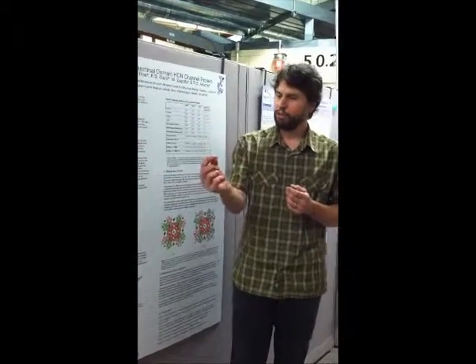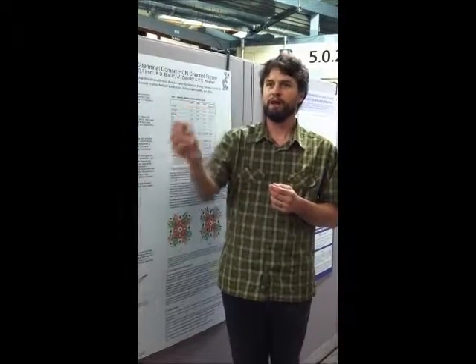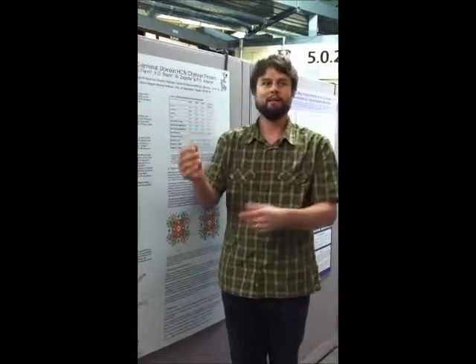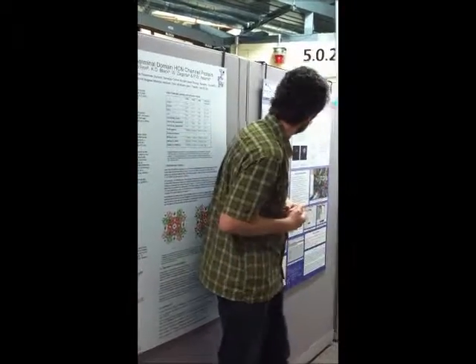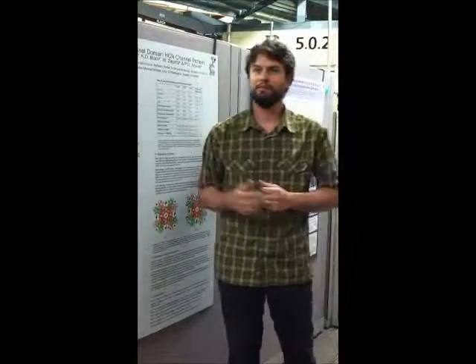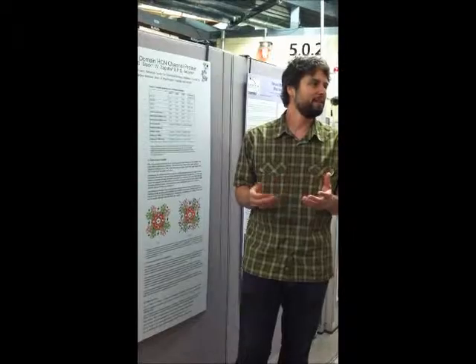What they do is put the sample there, and then they have sample holders that can spin the sample in all different directions, 360 degrees. And then they take snapshot after snapshot. And they look for diffraction patterns. We'll walk by one, they're not all that much to look at. Dark spots on a gray image. And then they back calculate where all the atoms had to be to give you that pattern.